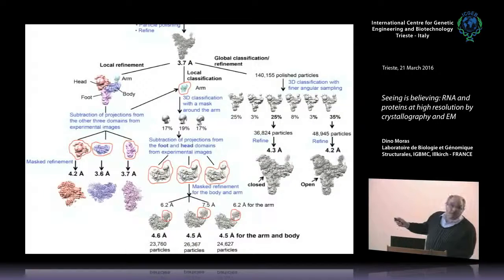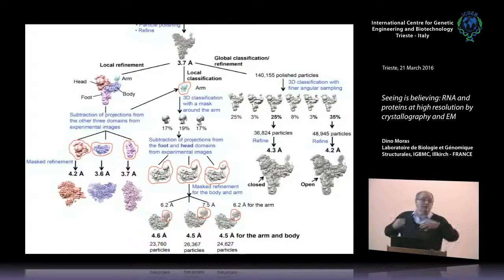You remember before we had a lot fewer groups, so you can refine data, and you have the highest resolution subgroup. Here you see, to come back to your question, closed and open conformation. You see here? So we start now with these 500,000 particles, a fraction of them is from a group in a given conformation. Another fraction is from a group in another conformation, each one with different things. And you can start. That's why, for this part, the resolution is much lower, because you have fewer particles which are common. Okay, so 4.3, 4.5.